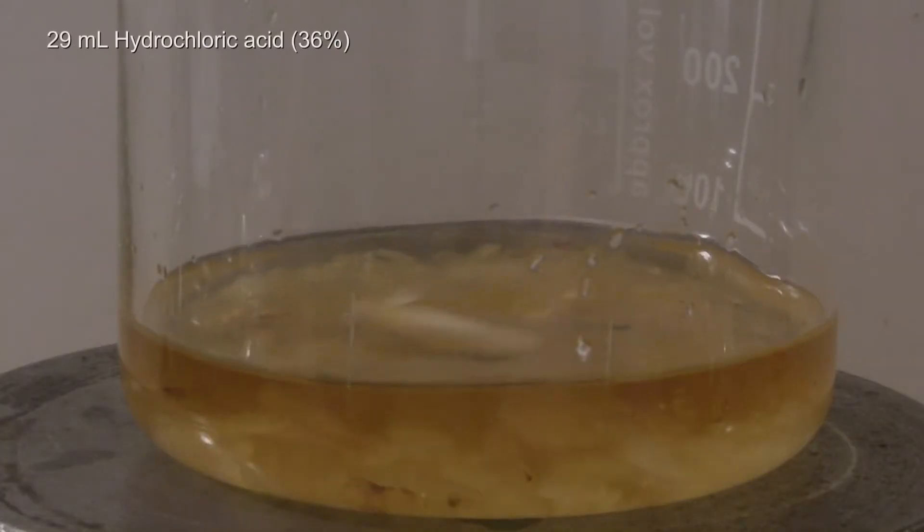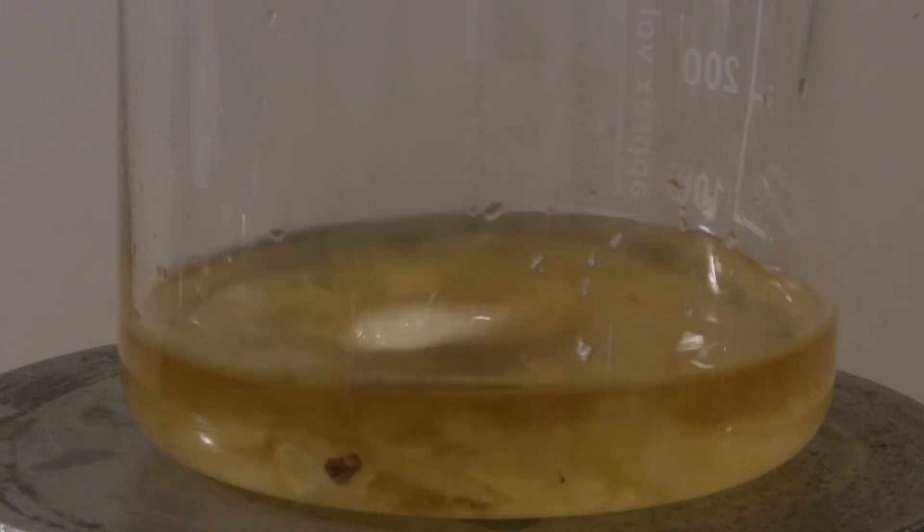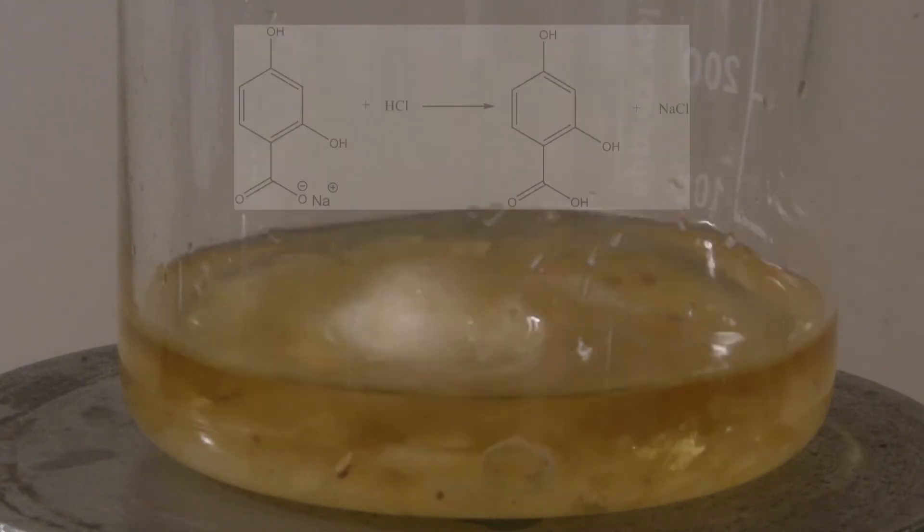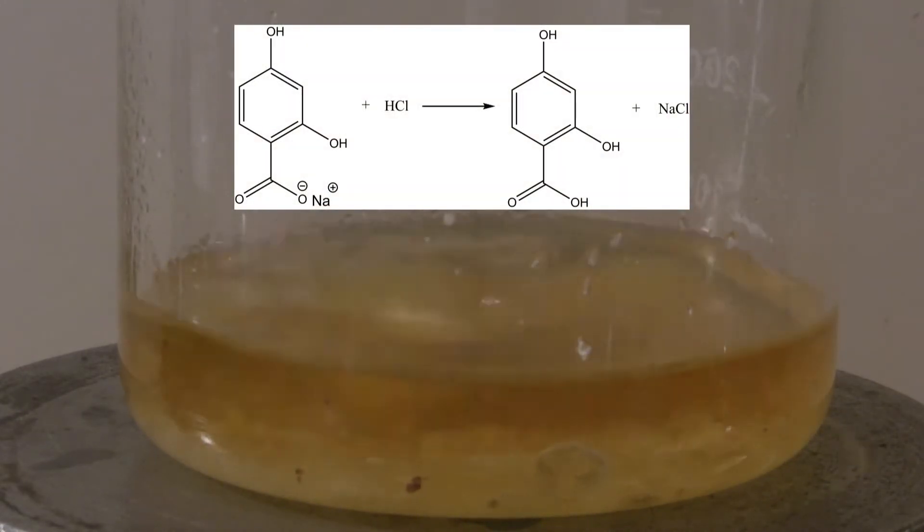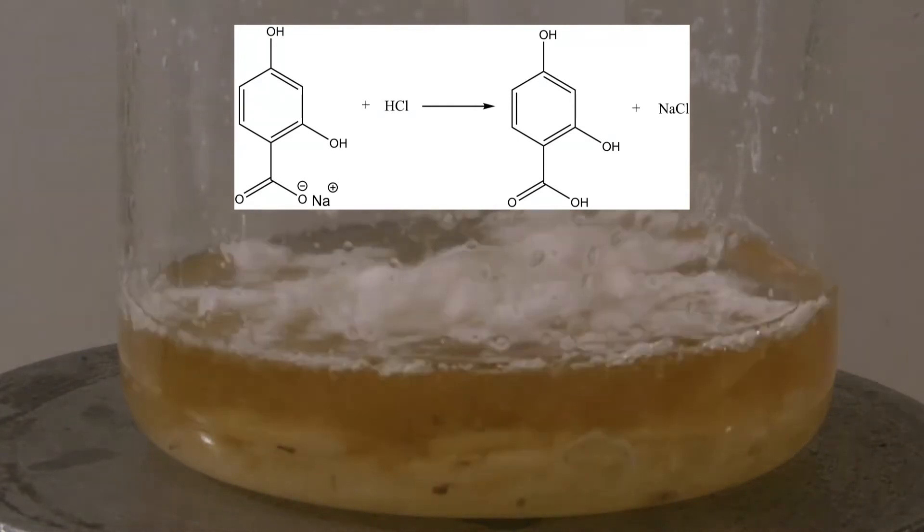Next, 29 ml of concentrated hydrochloric acid were added while stirring. This causes the resorcilic acid to be protonated and the free acid and sodium chloride are formed.